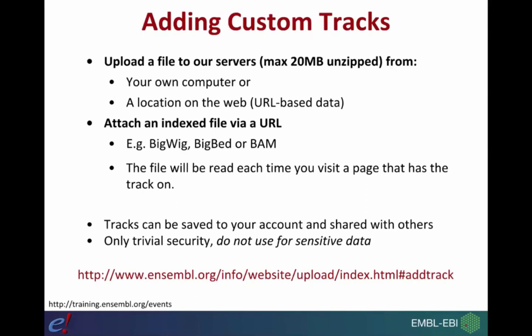Please be aware that if you in particular use these large files, the file will be read each time you visit a page where this track is shown. So this can slow down Ensembl significantly, and because of that, think very carefully about whether you really need this track, and also if you have worked with it and then don't need it anymore, please delete it again. And I will show how that works in a minute.